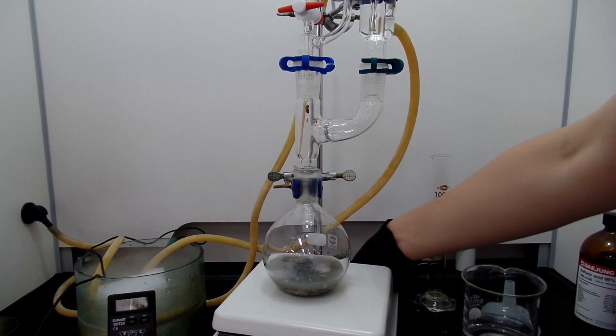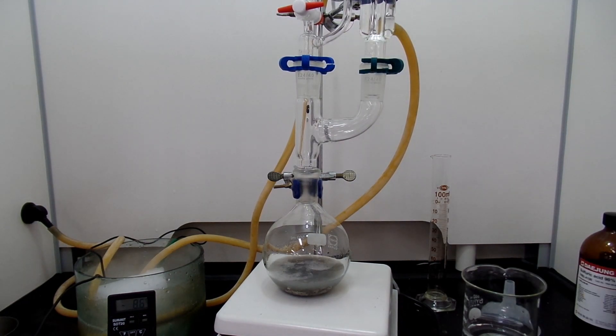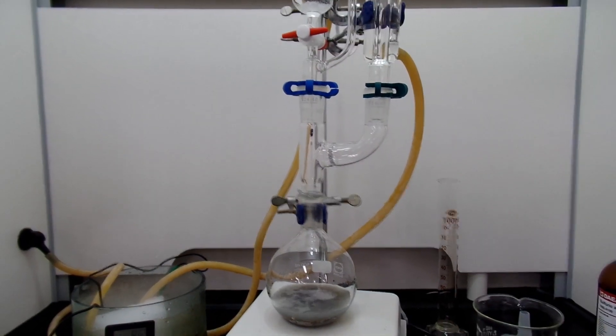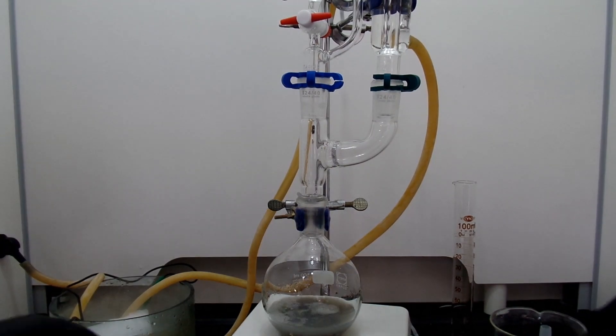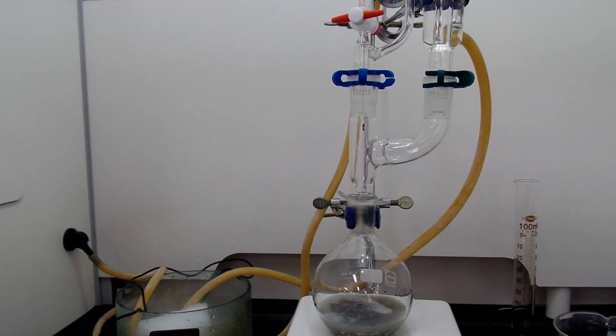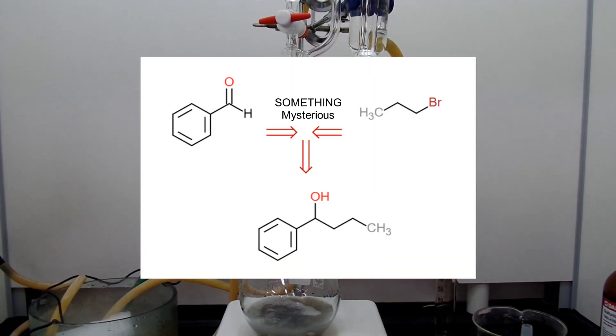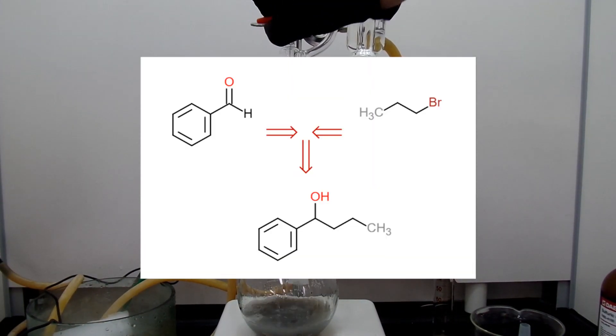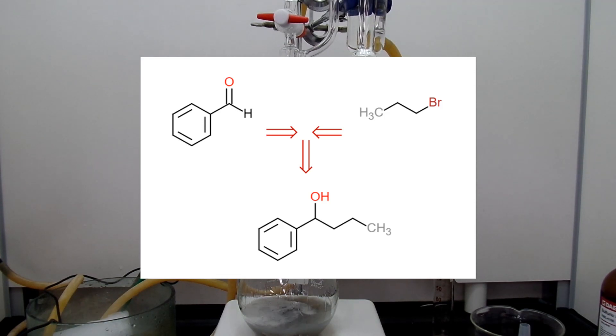So before I even started my reaction, I dried my ether with anhydrous calcium chloride that was dried in the oven. I also dried benzaldehyde and 1-bromopropane with magnesium sulfate. My plan is to make 1-phenyl-1-butanol by reacting 1-bromopropane with benzaldehyde.